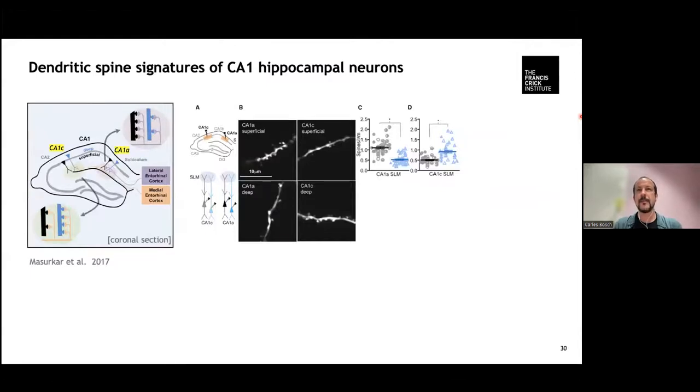But there's one particular benefit when we use X-rays in combination with electron microscopy, which is that on top of that near micron context across several cubic millimeters, we can also obtain ultrastructural context at a narrower region. And therefore, it is particularly interesting to answer biological questions that are determined by that duality of features: local features at the ultrastructural scale with larger features within a further than 100 micron distance.